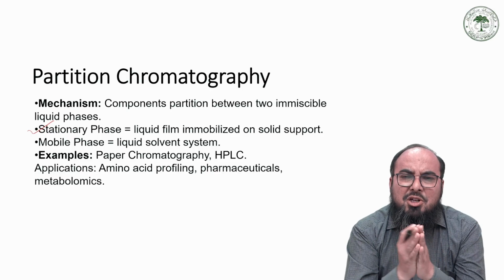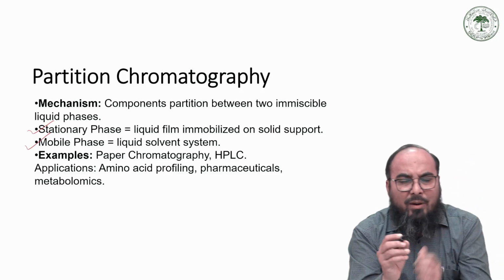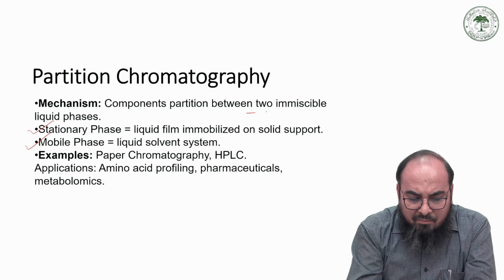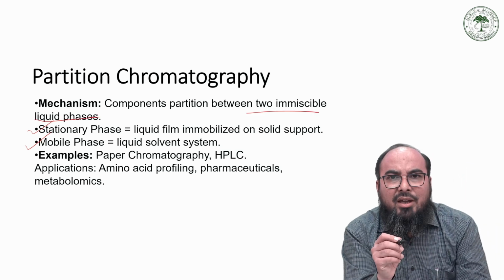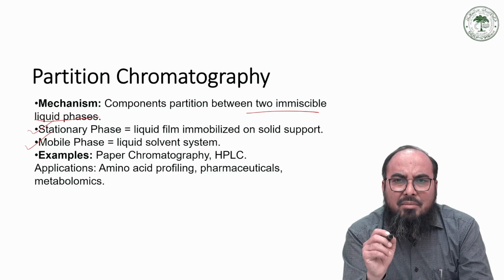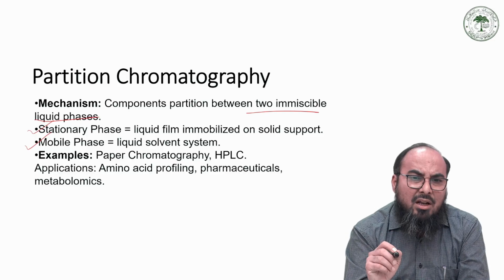The partitioning of different constituents occurs between the stationary phase and the mobile phase, and these two liquids must always be immiscible. So here the basic principle is the partitioning of components between two immiscible liquids.